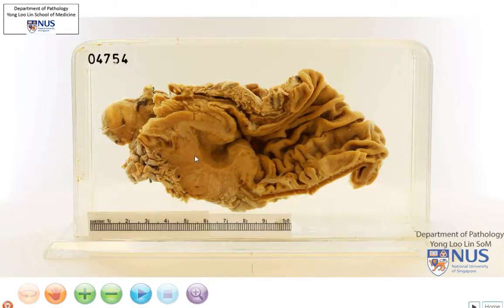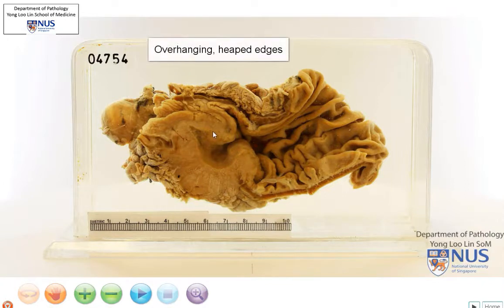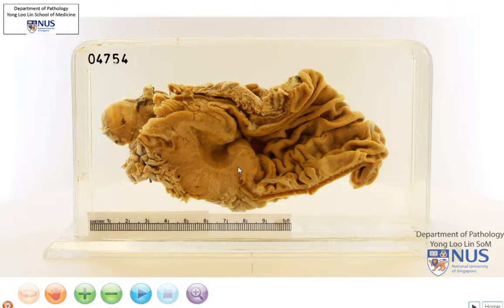The main pathology is a very fleshy, large ulcer at the antral region, and you can see that the edges are sort of hanging over the base of the ulcer. We call these overhanging edges, or heaped edges, and this is a feature that suggests a malignant ulcer, as opposed to a benign ulcer, which will have a very punched-out appearance without these overhanging edges.